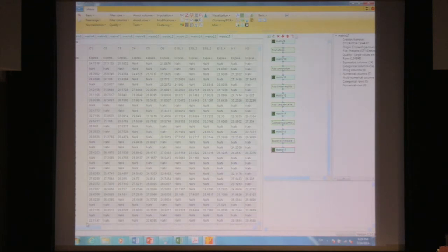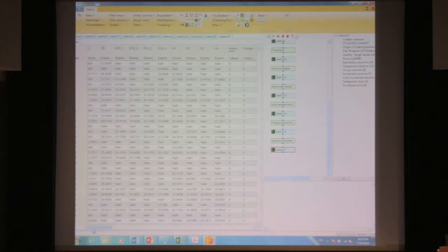Okay, so we lost the grouping there because we expanded site tables after creating the grouping. Apologies for that. So we need to then define the groups again, but at least now we have 1/3 the number of columns.